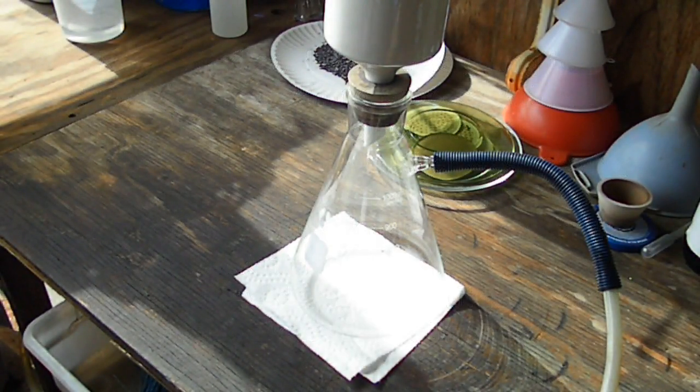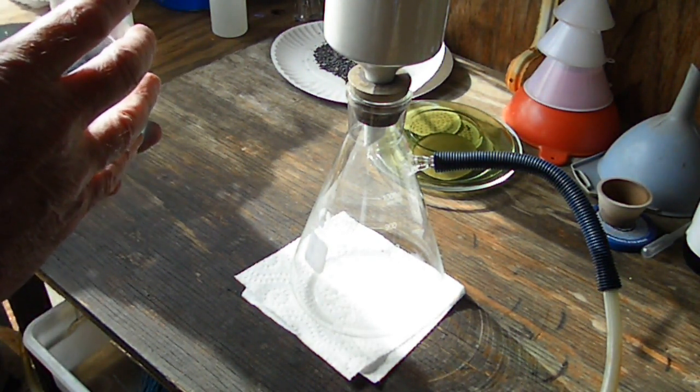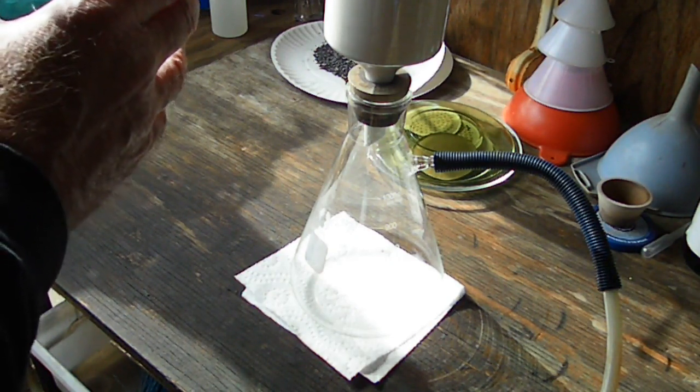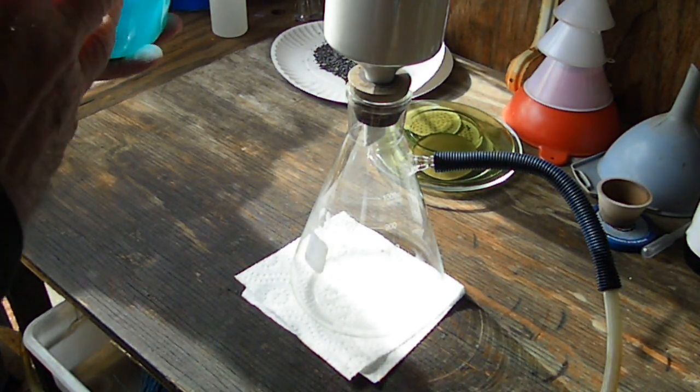Okay guys, we are set up to filter. I've got the vacuum hooked up just in case. I am going to do my best not to get silver nitrate on me. It seems that no matter what I do, gloves, no gloves, whatever, I always get it on me. But anyway, we've got quite a bit of dust in here. I believe it's that tungsten dust. So we got about, looks like about 450 milliliters of solution.